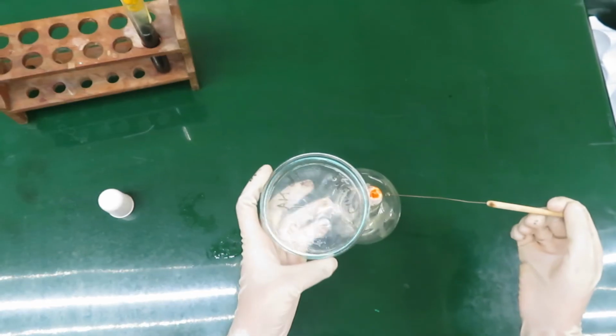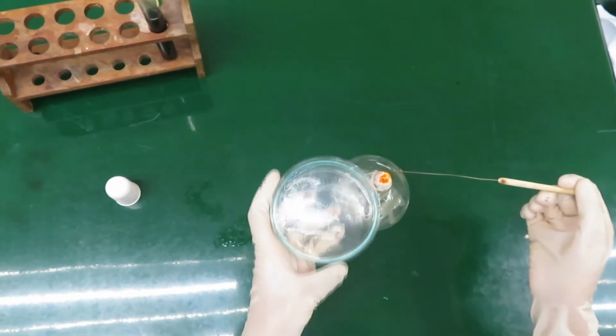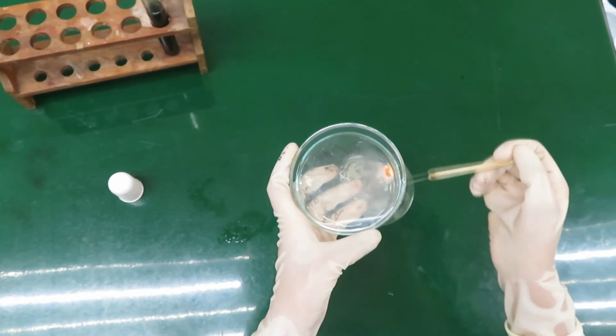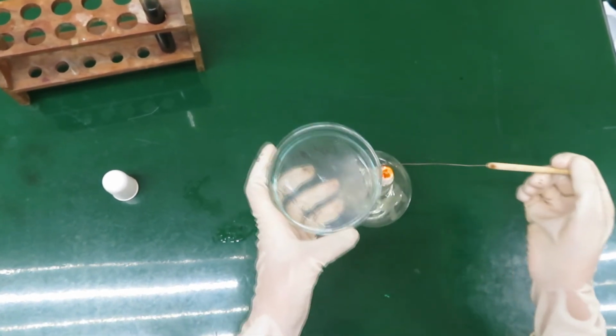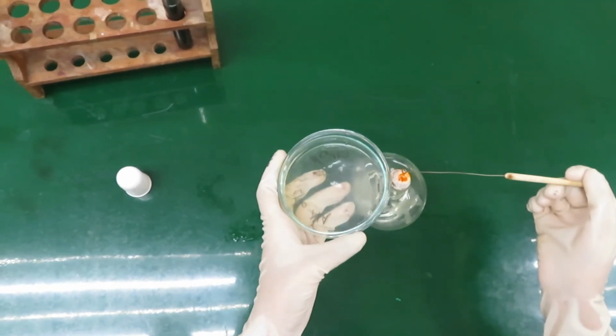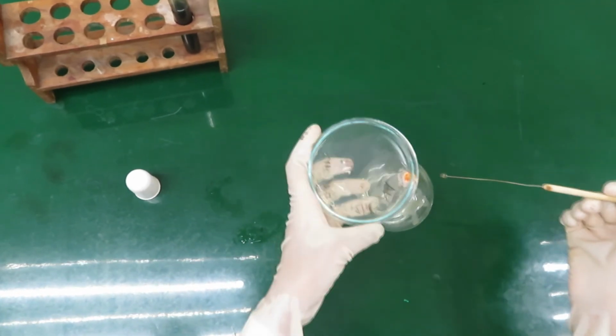5. Flame the metal loop again and turn the petri dish 90 degrees to streak the second quadrant. Use the loop to touch somewhere near the last streak of the first quadrant. Then, with the same pattern, move to the second quadrant. Close the lid when the second quadrant is filled.